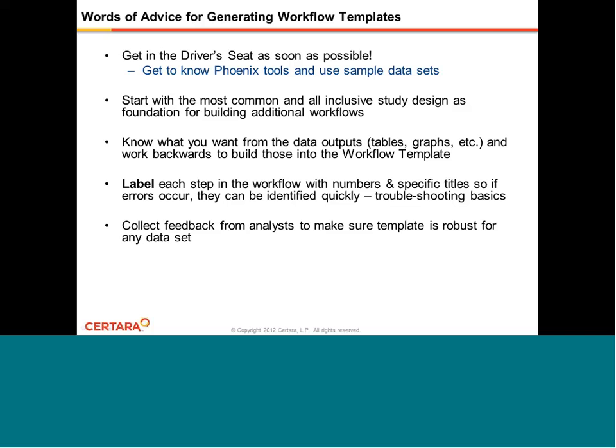We also recommend labeling each step in the workflow with numbers and specific titles, so it's very easy to backtrace and find any step that you want to modify. And then collect feedback from analysts to make sure the template is robust for any data set.